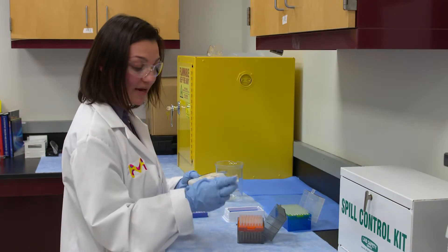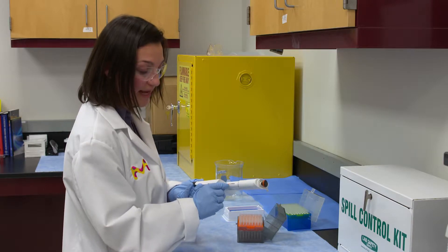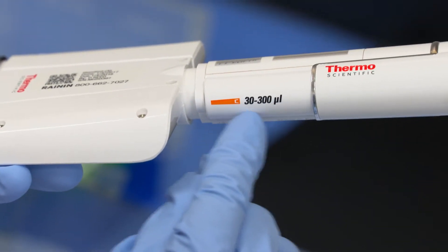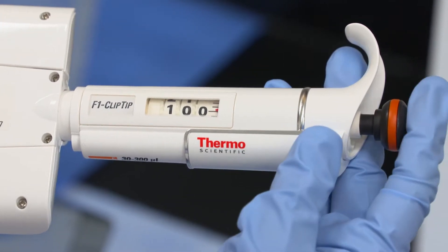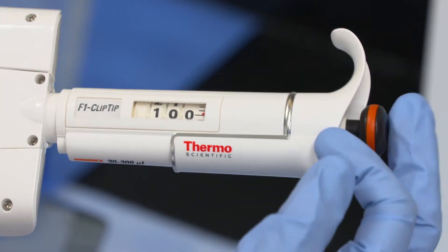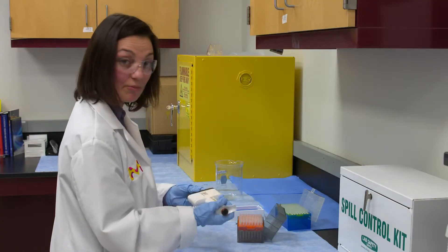I'm going to select the volume that I want to use. This one gives me a range between 30 and 300 microliters. I'm going to select 100 microliters, so I'm just going to turn and I see 100 there and I'm going to lock it back in place and now I'm ready to go.